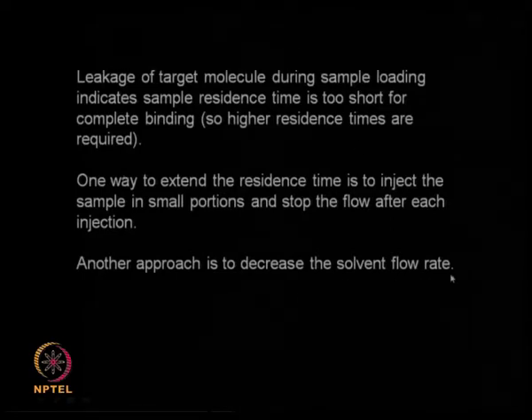Another approach is to decrease the solvent flow rate. Of course the third approach is to modify the system so that the Kd value becomes smaller and the binding is stronger. But process wise, we can inject a little bit, stop, inject a little bit, stop, and so on. The other approach is to reduce the solvent flow rate, because your residence time is too short, that is why your target molecule is getting leaked out.